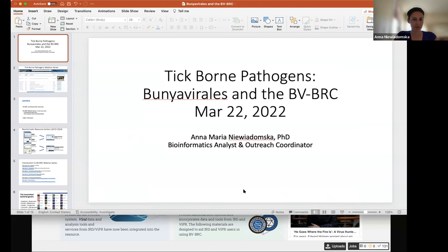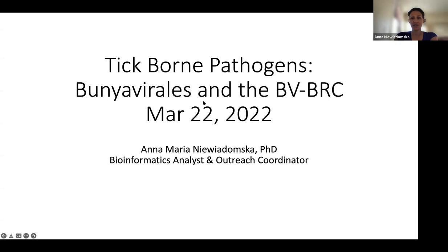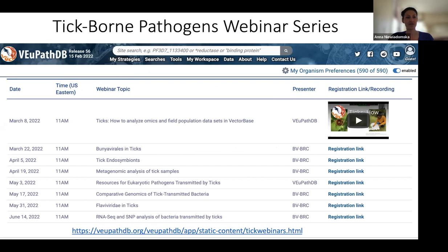Since we're a little behind, I think I'm just going to jump right in. Thank you so much, everyone who's attending today. This is the second of our talks on tick-borne pathogens. Today I'll be talking to you about Bunyavirales and how you can search for data and analyze them in the Bacterial and Viral Bioinformatics Resource Center. My name is Anna Maria Niewidomska, and I'm a bioinformatics analyst and outreach coordinator — Omar's counterpart at the BVBRC — and I focus on viruses.